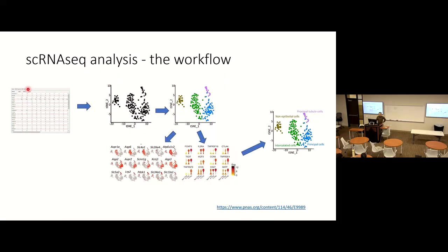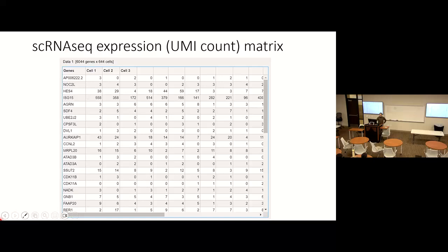So let's put this dimensionality step in the whole pipeline of single-cell RNA-seq data analysis. Once you have this expression matrix, we normally do dimensionality reduction to reduce the variables used to describe cells. There are some easy ones. For example, if these 2 genes are expressed almost linearly correlated, you probably can use just 1 gene, or the average of these 2, to replace 2 genes. So you reduce dimension by 1.